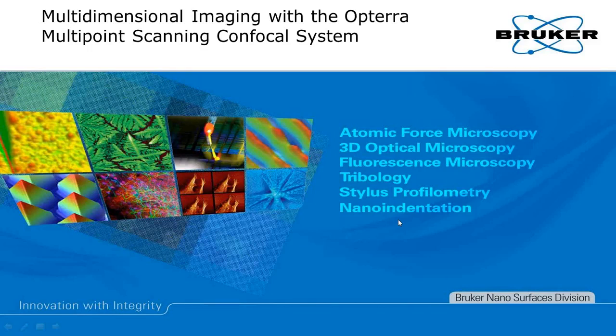This presentation is titled Multidimensional Imaging with the Opterra Multipoint Scanning Confocal, and is presented by Jeff Stuckey.